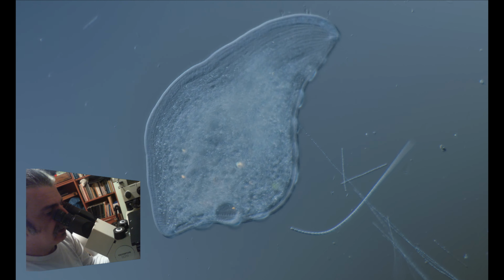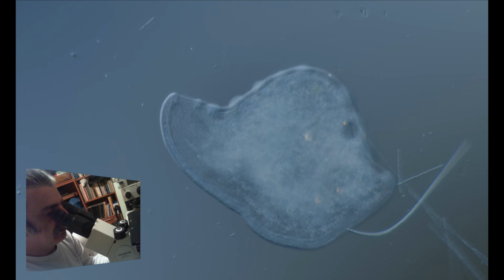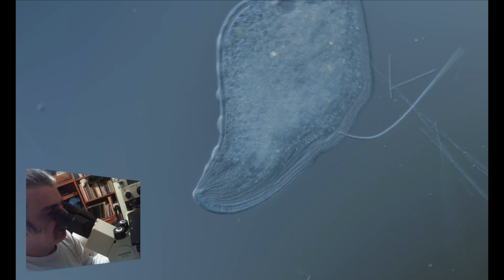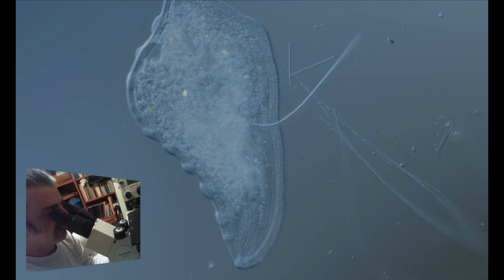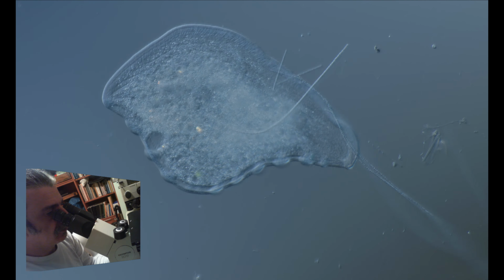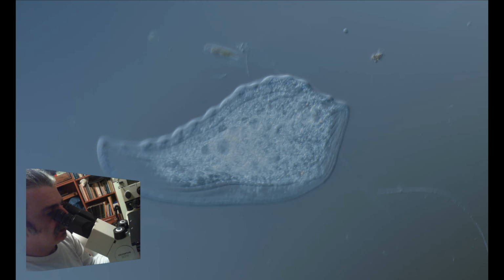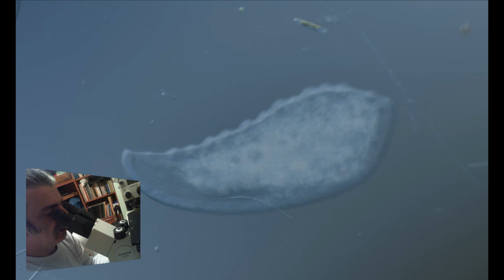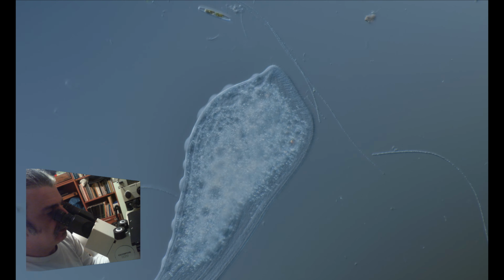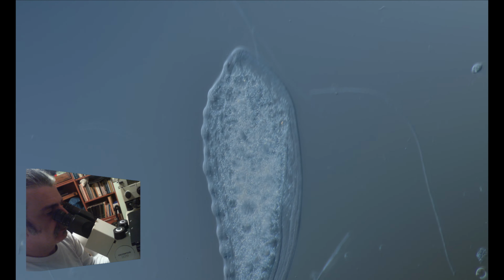You can see the fine lines surrounding it, which contain the venom cells. Supposed to be another one on the right. Here it is. You see they change shape quite often, from elongated to more dense.